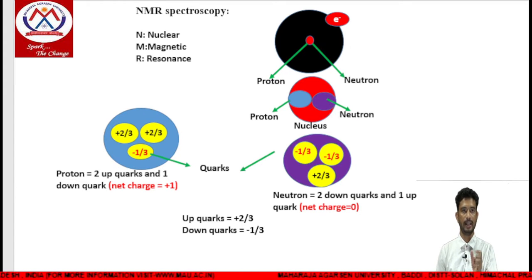And what is that interaction? That interaction is particularly related to resonance. So resonance in spectroscopy, definitely we are talking about the magnetic field and frequencies. So matching of frequency with some other frequency. What is that something that we are going to discuss here?